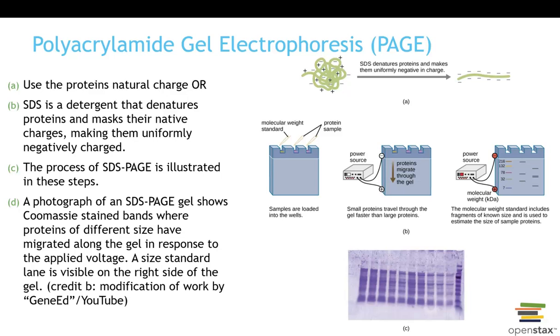And the gel that we're going to use is made of different chemicals, so they call it polyacrylamide instead of agarose. Also, this technique we perform using a vertical gel instead of the horizontal one that we talked about in the gel electrophoresis technique previously. Again, there are some wells where we can load our protein, and then we use electricity in order to separate and move the protein through the gel. And proteins can be separated based on their size and charge as well.